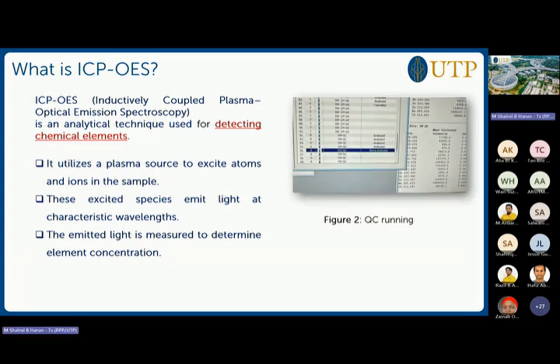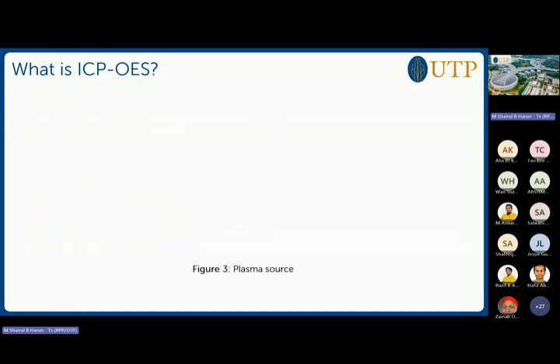You can see on the right side how the QC is running, for your example view.